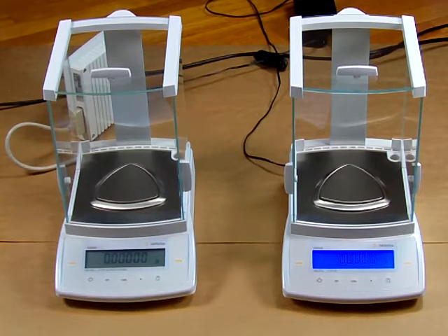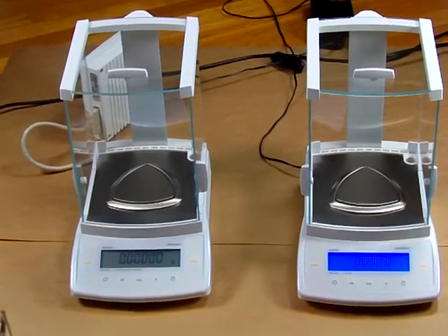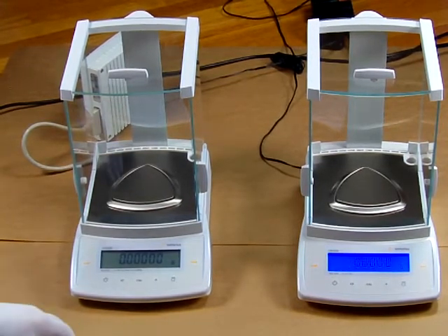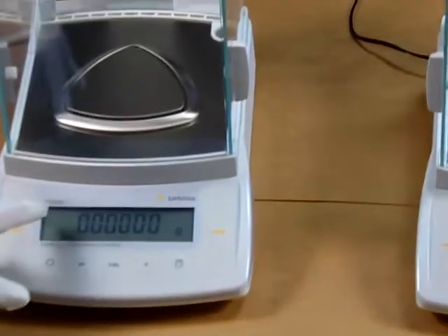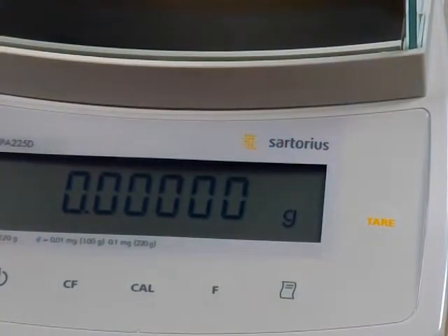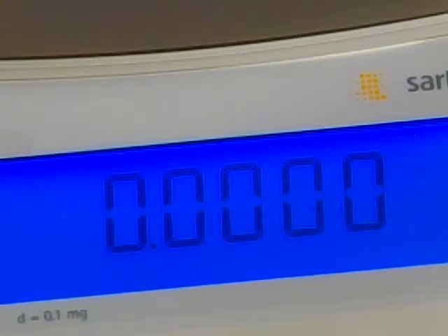Welcome to Precision Weigh-In Balances. Today we would like to introduce to you the Sartorius CPA324S, which is on the right, and on the left we have the Sartorius CPA225D Semi-Micro Balance. Notice the CPA225D is a 5 decimal place balance and there is no backlight display. The Sartorius CPA324S is a 4 decimal place balance and has the backlight display.